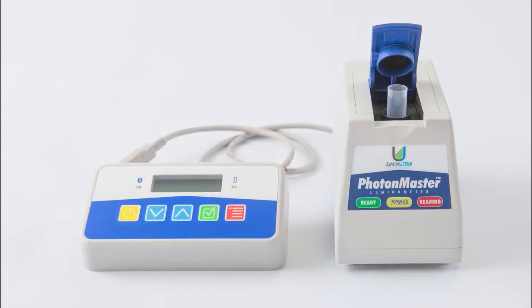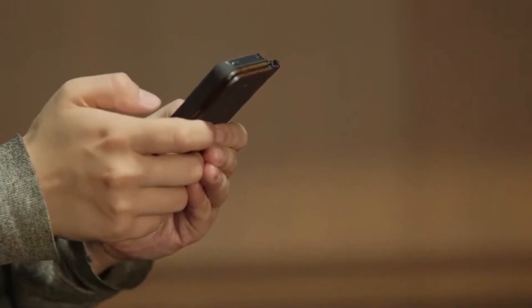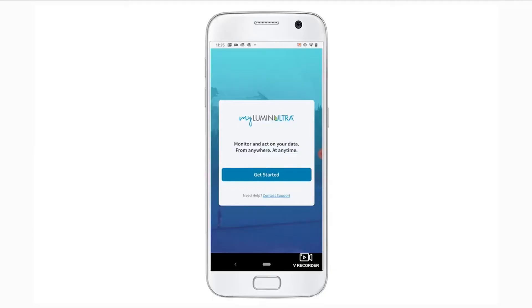The first step is to ensure that the PBM device is charged. Next, ensure that the Bluetooth connectivity on your mobile device is turned on. Then, make sure that a site has been created along with the sample location for that site in MyLumin Ultra. Without creating a site and a sample location in MyLumin Ultra, you cannot run a test or add data.